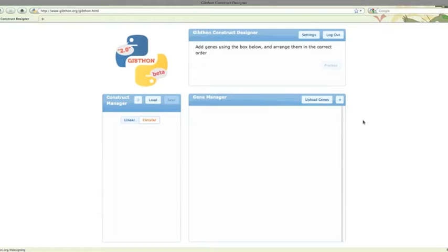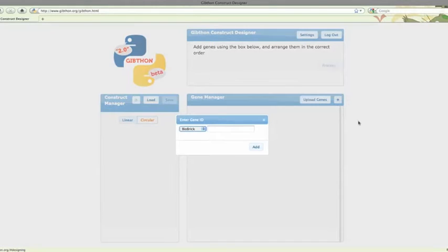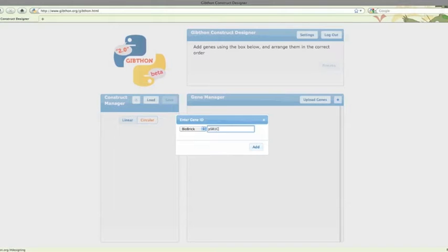First off, let's add the plasmid. This is quite easy. We just type PSB1C3 in the box, and up it pops.